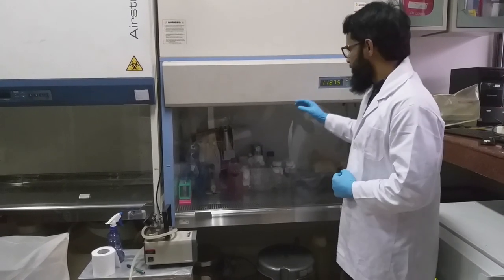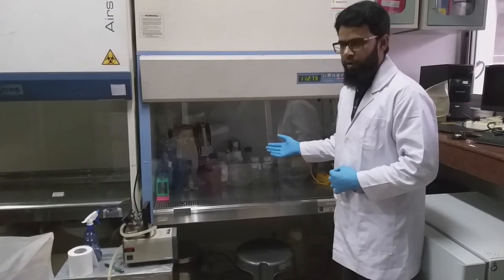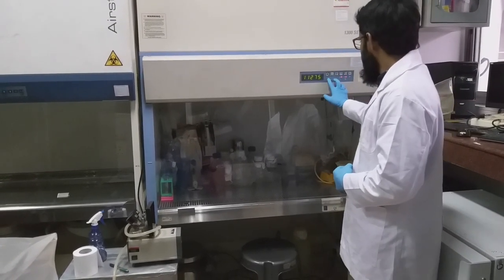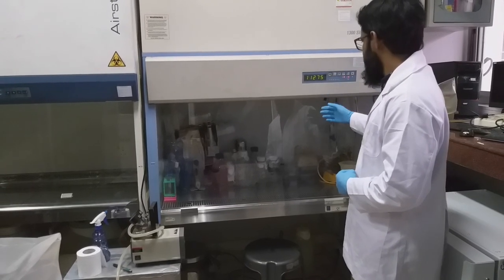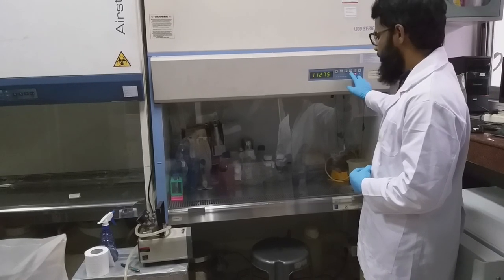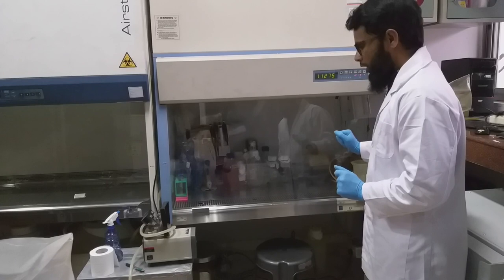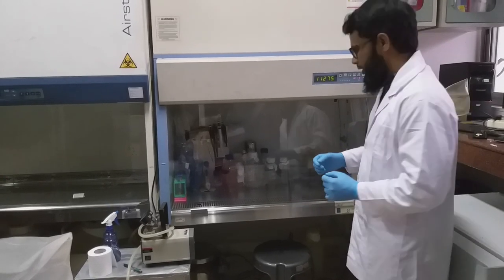So this is a typical biosafety cabinet in which we perform the filtration for media. This is the control panel which is used to operate this machine. This is the on and off switch. This is the switch for normal light. This is the switch for UV light. Now I will be demonstrating how to filter the media.